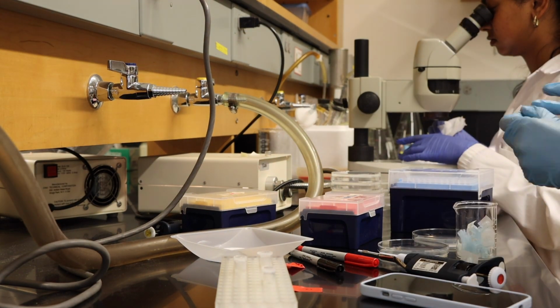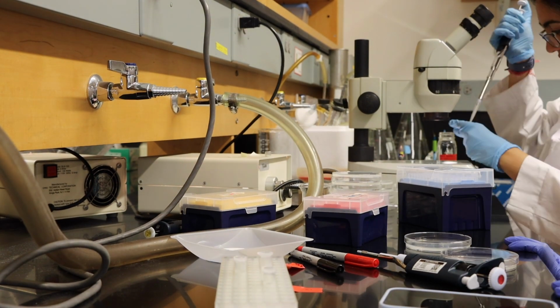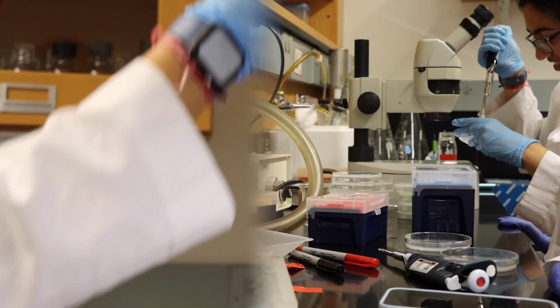to said odor. From the Bargman 1993 paper, the odors that C. elegans preferred the most was found. Therefore, we chose isoamyl alcohol to conduct this assay.